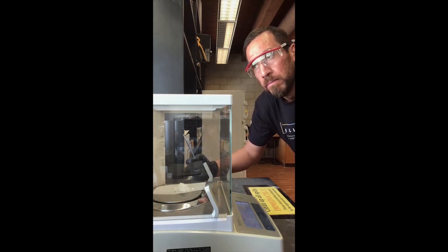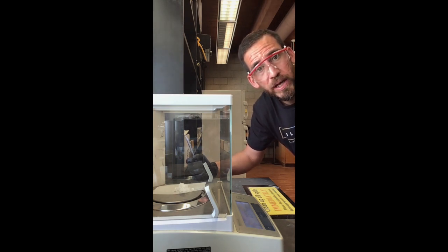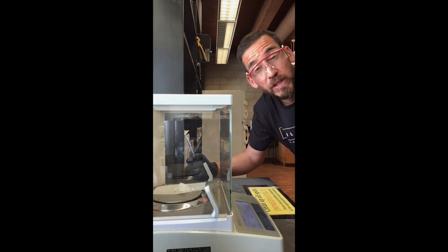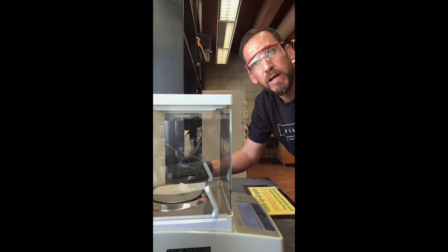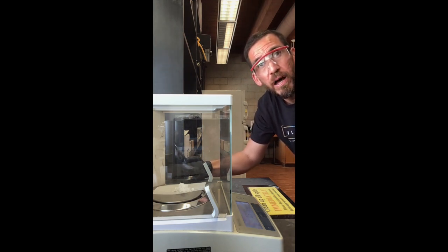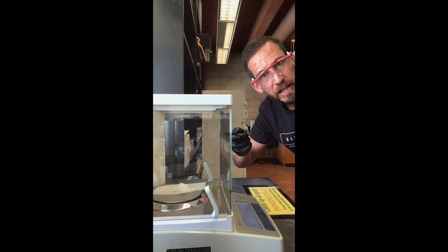So keep in mind, the stuff that went through the Buchner funnel, that was in solution, right? And so the recrystallization process is a purification process. And so the stuff that went through the flask, or the Buchner funnel filter, is going to be less pure than this stuff right here. So I don't want to combine it, even if it was just solid material. Recrystallizing it again is totally okay, but keep in mind that this is probably going to be the purest and largest batch of material that I can get out of it.